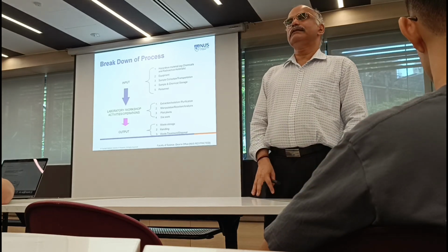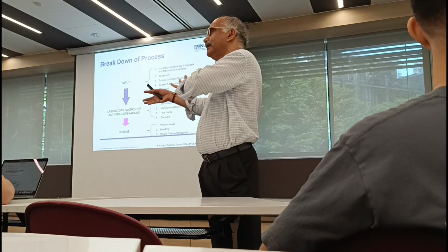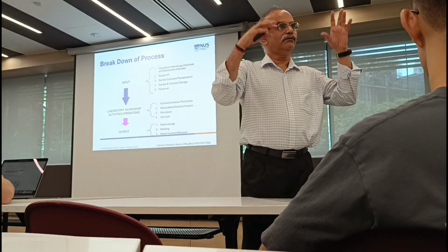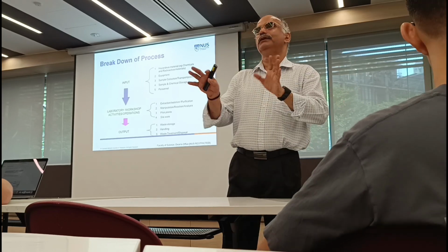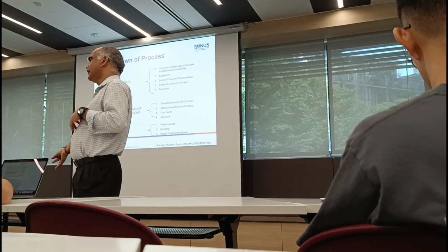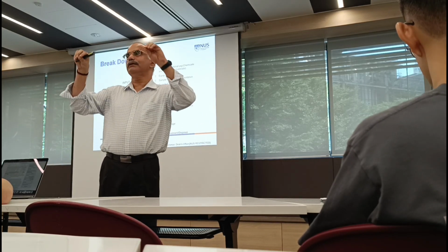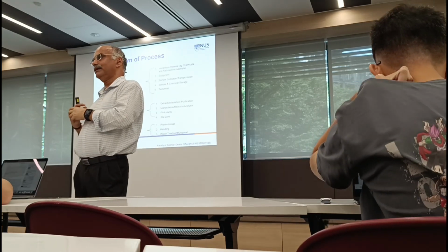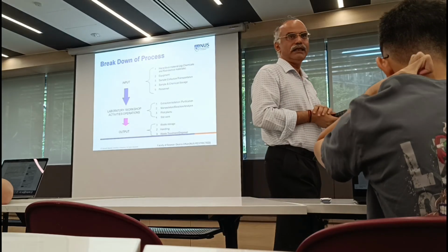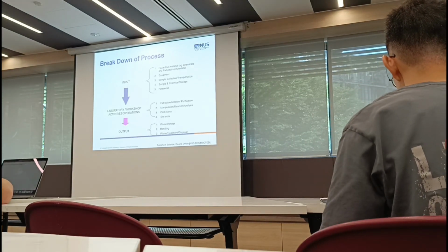Now, risk assessment is for the entire reaction. Risk assessment cannot be done half a little bit, and then you set up a reaction and come back to do the remaining one, how to purify compounds, those kind of things. No, you do the entire process until you get characterization done. Yeah? What kind of product you expect, etc. Because as I said, for every reaction you have an idea what you expect at the end. Yeah? You should have. If you do not know, then don't do that reaction. Yeah? So you have to do your risk assessment for the entire process.